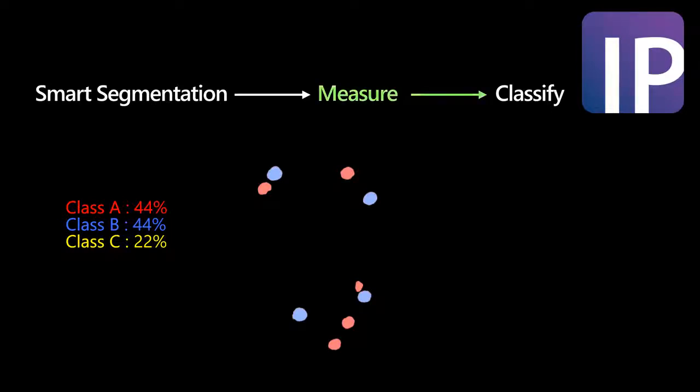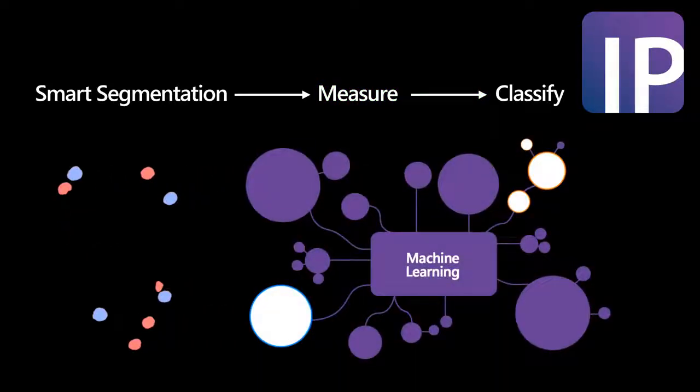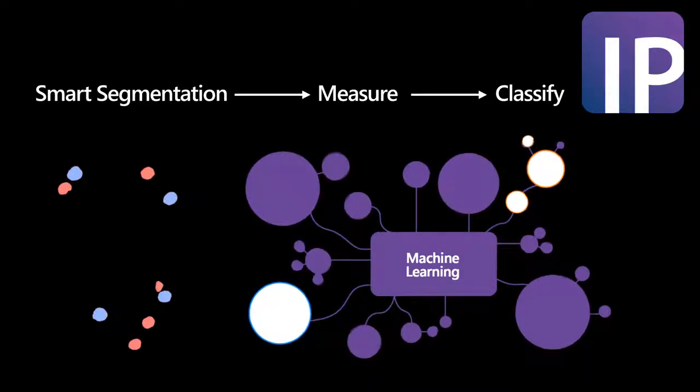ImagePro will auto-classify objects based on a measurement or several measurements from the previous stage. Learning classification, a machine learning based method, can isolate populations of objects based on small morphometric or intensity differences to correctly assign and classify the objects.